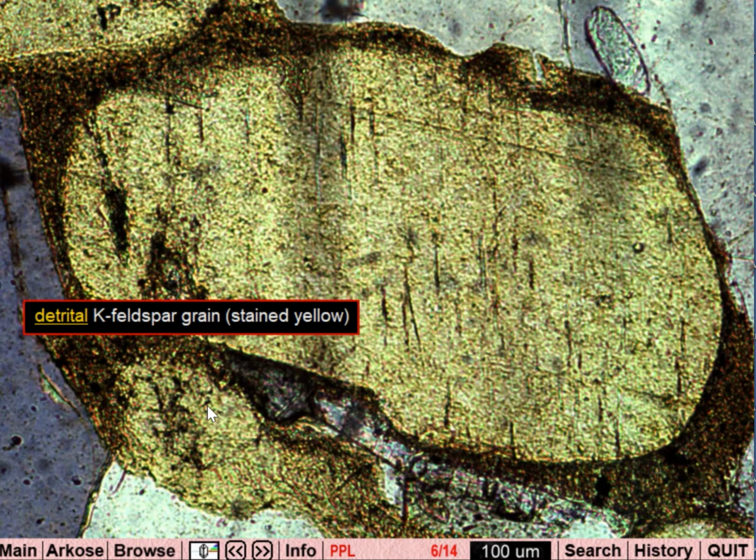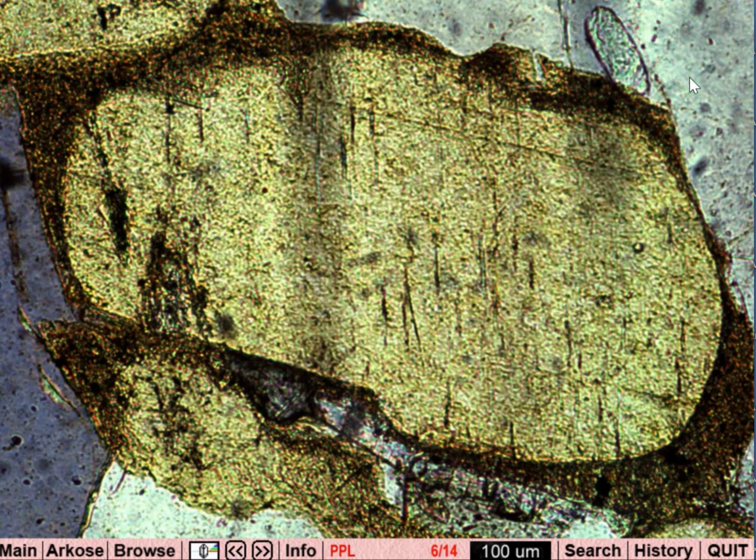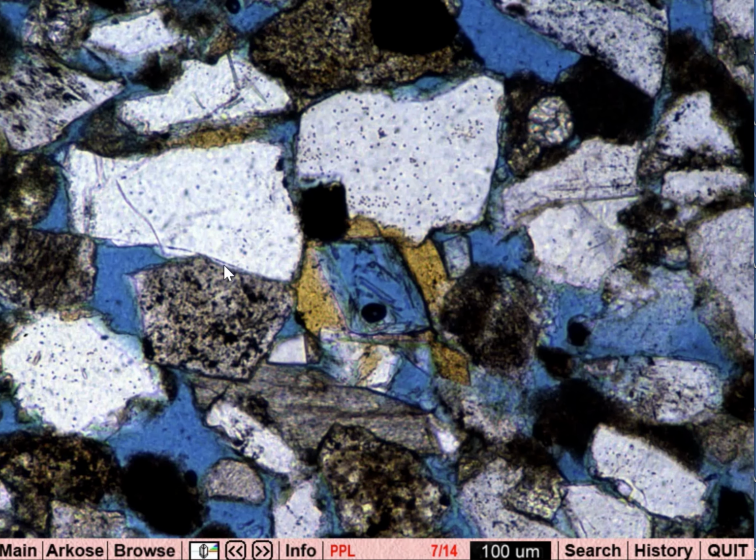And it can be difficult to tell where the initial detrital grain, the smaller one and the bigger one, where the original boundaries were. Okay, lots of quartz, in the relatively clear, maybe a volcanic rock fragment here, maybe calcite or a volcanic rock or a partly dissolved feldspar, and then there's our primary porosity.